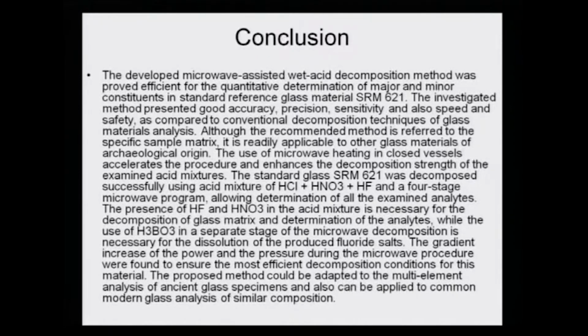That means it is a method which is not only for the reference sample, but it is also meant for modern glass samples and old time ancient glass samples. So, it is a method for all types of glass samples. A complicated and very intricate analytical method has been developed.